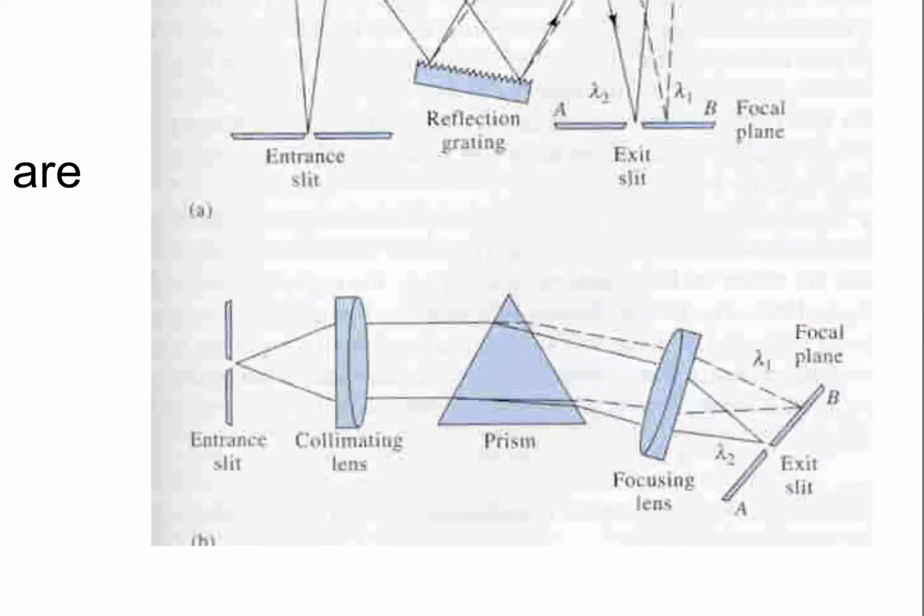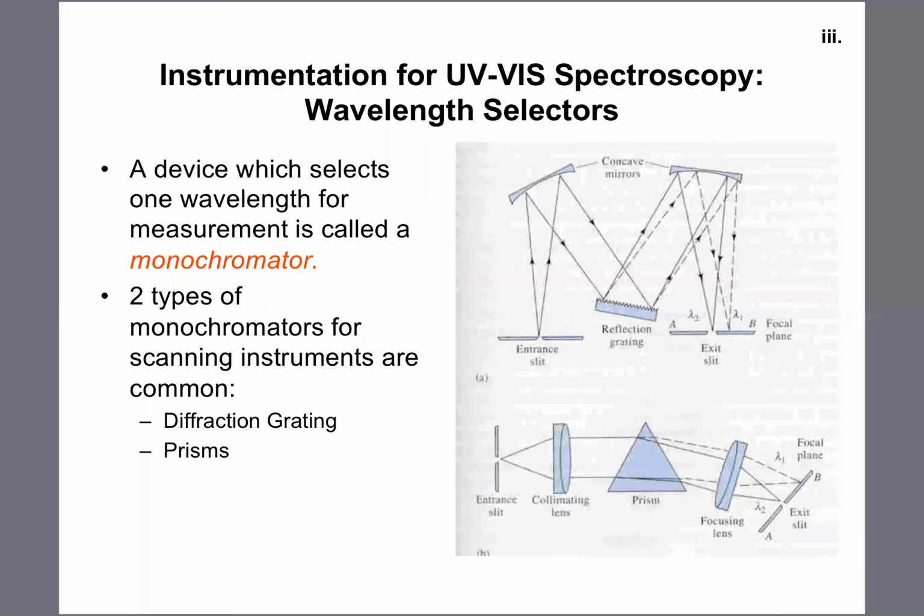Okay. Well, it turns out it's pretty easy. You just attach this prism to like a little cam that you can rotate, or a little knob that you can rotate, basically. And that actually moves this back and forth on our focal plane. It moves the spots back and forth, so you can easily tune what color of light you want. It's a very, very simple thing to do, and typically that's what happens.